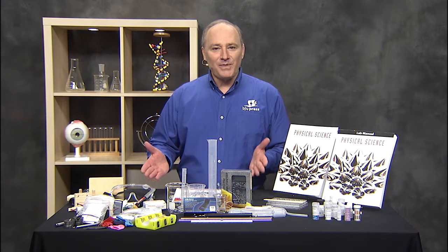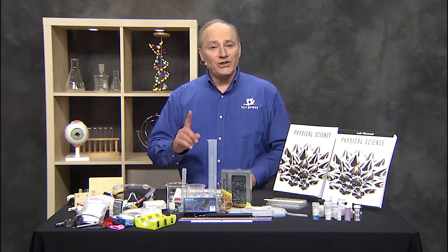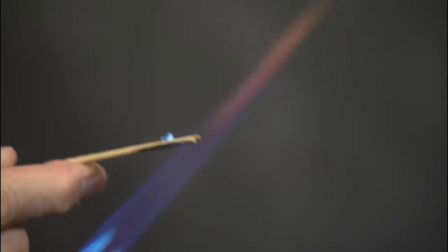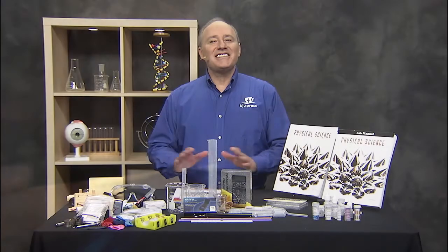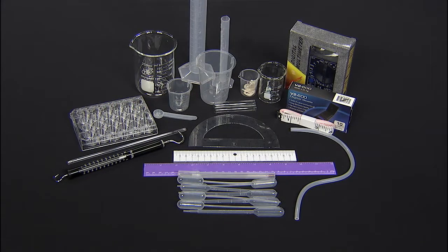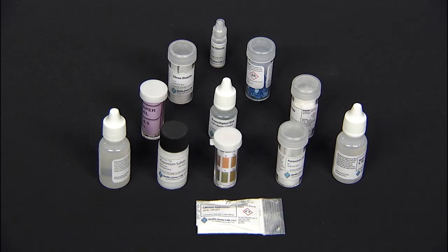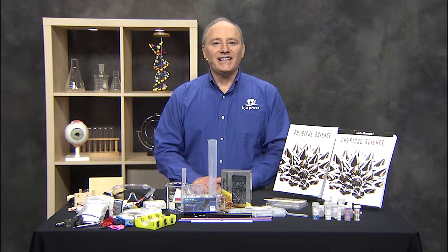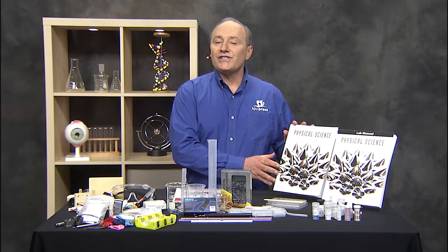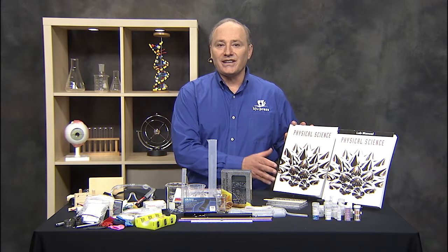Now I'm guessing that you don't have a spectroscope around the house, but you can still examine the spectra with this lab. The kit contains everything you need for observation, measurements, and chemicals. So there's a quick look at what you get in the Logos Physical Science Kit that goes with the BJU Press Physical Science 5th Edition Textbook and Lab Manual.